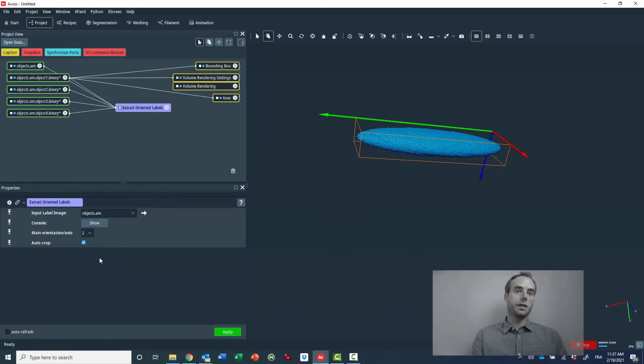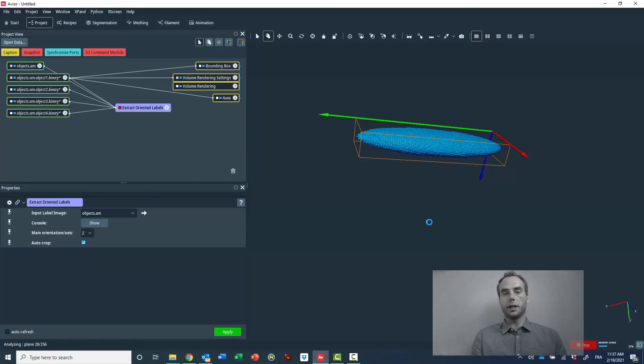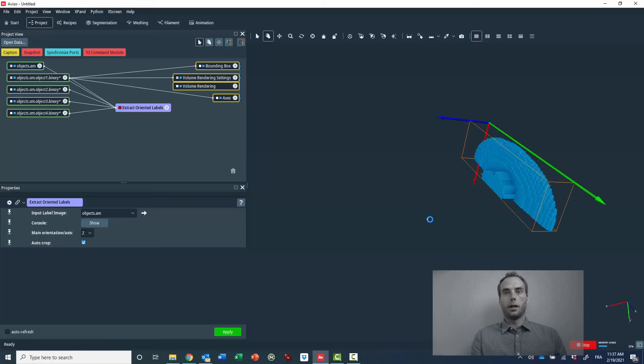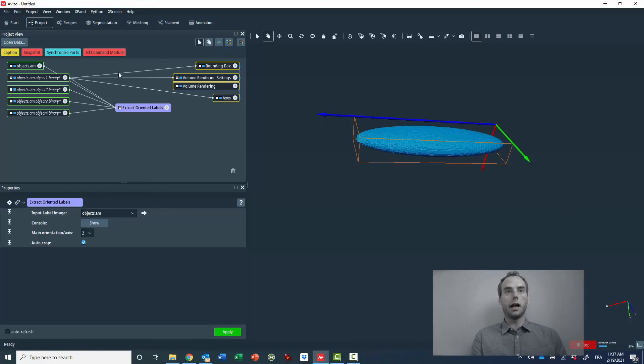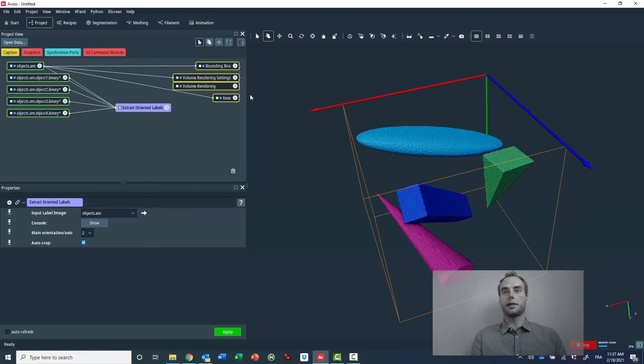Now I'm switching to the Z axis and I recompute the extraction and resampling. And now you can see that the main orientation of the ellipsoid is completely aligned with the Z axis of the local coordinate system.